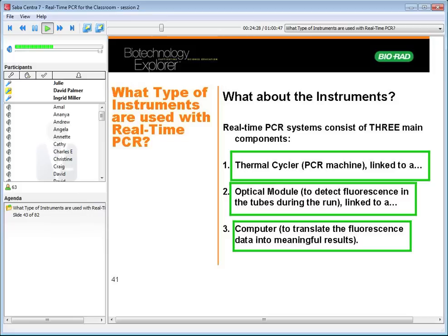There's really nothing fancy about the real-time other than you're using a slightly different polymerase. You're also using plastics that the real-time instrument can see through, so you can't use opaque caps and things like that. And you're running the samples on a real-time instrument. So it's really easy to do. You could even design your own primers if you like. To get started with, there's really no difference between conventional PCR primers and real-time. It's only if you're trying to get super optimized reactions that you need to worry about that.